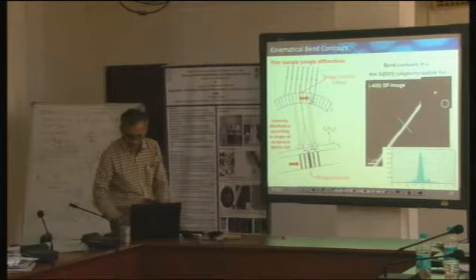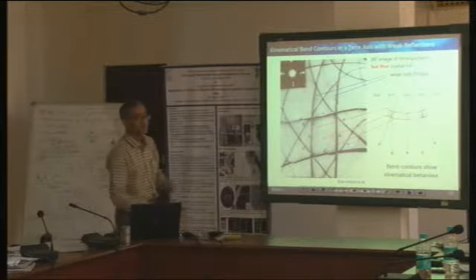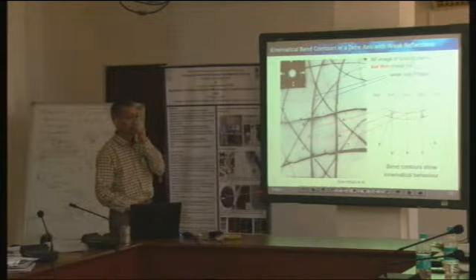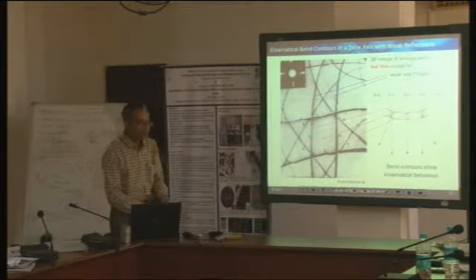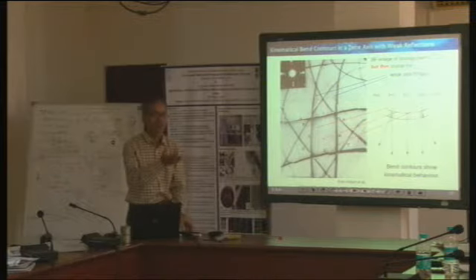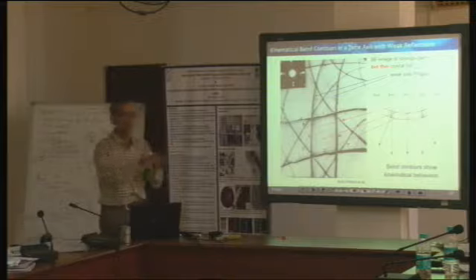So in the literature, in most of the cases, they go by the statement that bright field has less information compared to dark field. Usually dark field has much more information than bright field. It is correct in the following way, that I am also telling the same. I am telling slightly differently, true, but I will explain.